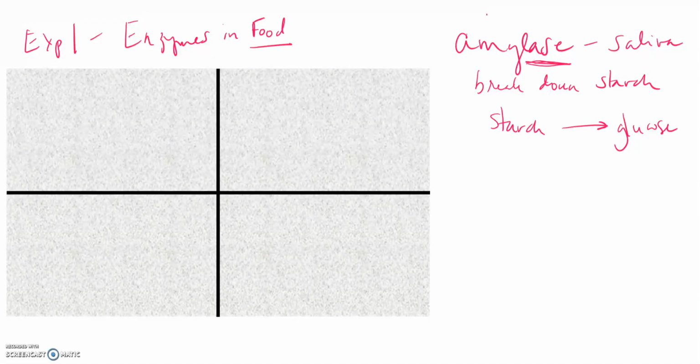All right, the other important thing about amylase, besides being found in your saliva, amylase is also found in many vegetables or fruits, okay? Naturally occurring there. And so in this particular experiment, this quadrant represents a paper towel, and it's divided into 4 quadrants. Remember that you sprayed a starch solution all over the entire paper towel and allowed it to dry.